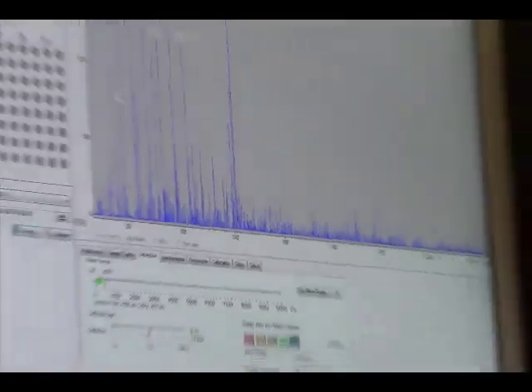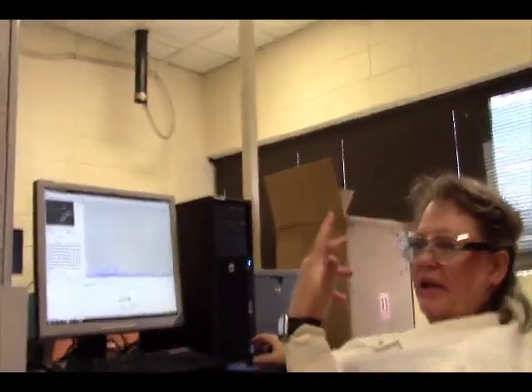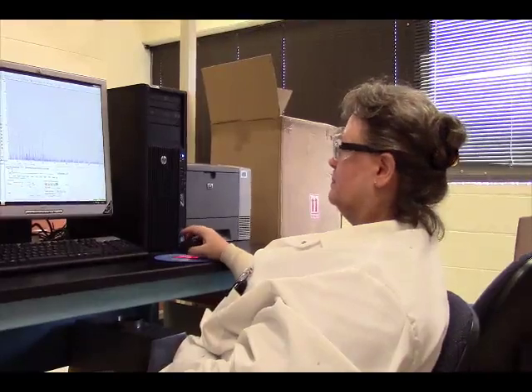The good thing about the MALDI is the cleanup, because now all I have to do is pull my plate out, spray off the plate with whatever solvent that analyte's soluble in, let it dry, and put it away. That's it. It's pretty nice. The cleanup is anyway.